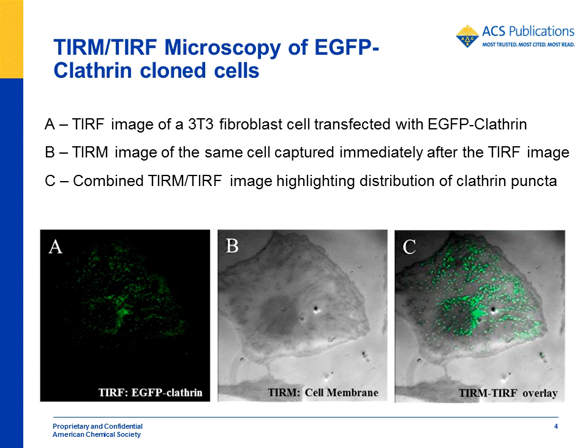Panel B shows a TIRM image of the same cell at the same spatial location, showing the cellular membrane within the microscope's imaging depth. Cell adhesion points, lamella structures and the nucleus are visible on this image. Panel C is an overlay of the TIRM and TIRF images from panel A and B and illustrates how combined TIRM-TIRF microscopy can be applied to study an event occurring at the non-labeled cell membrane by non-fluorescent TIRM at high topographical resolution, while concurrently viewing fluorescently labeled cellular structures of interest.